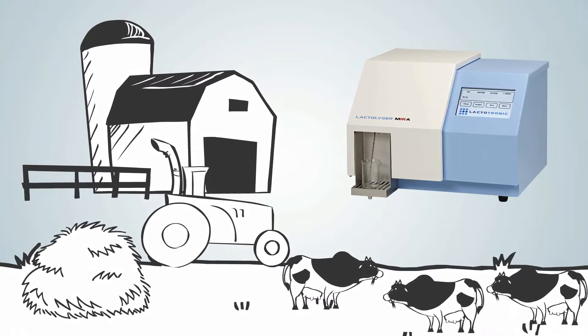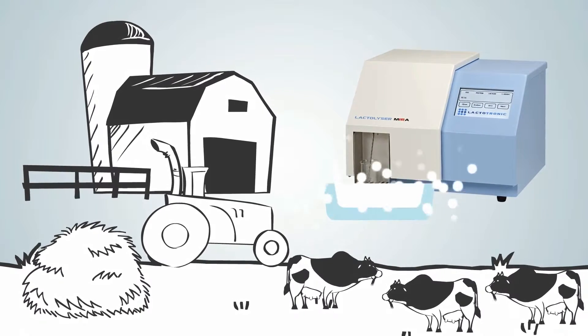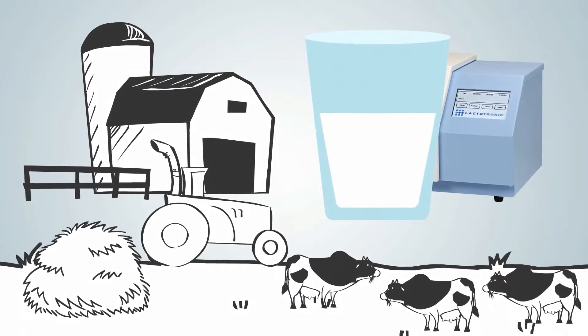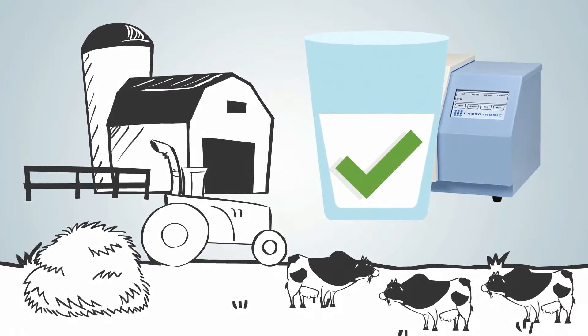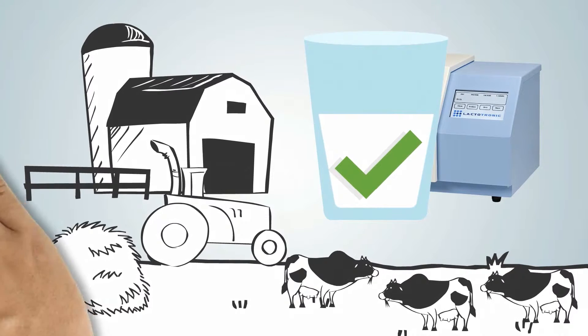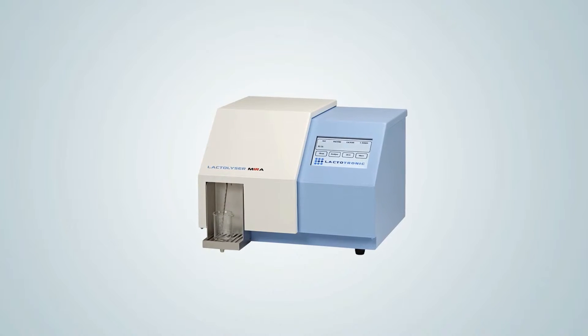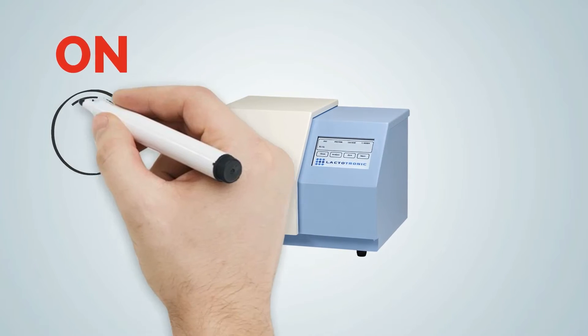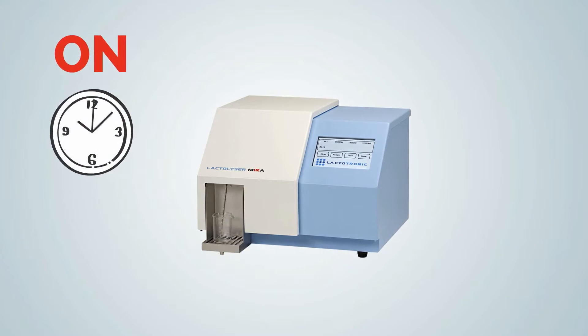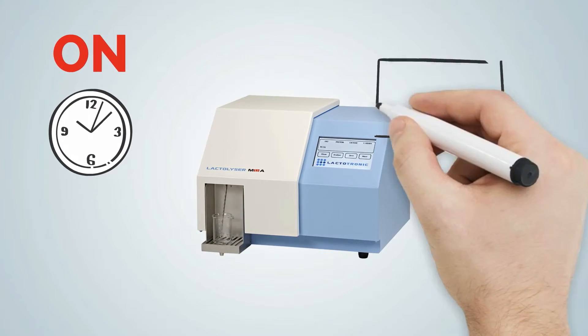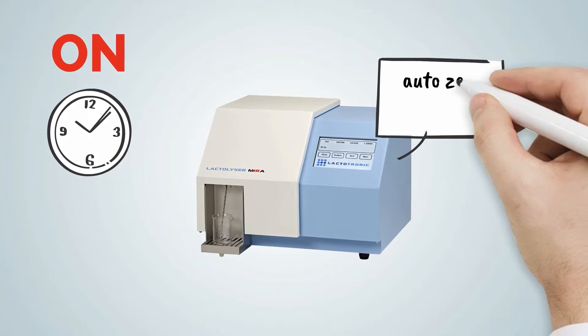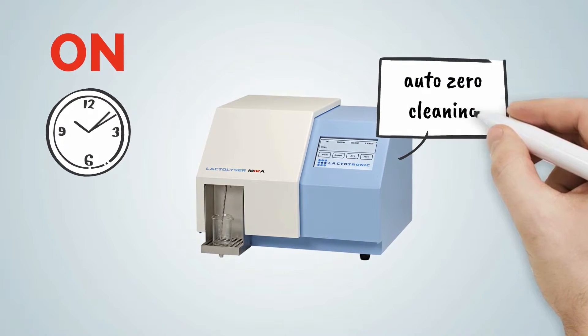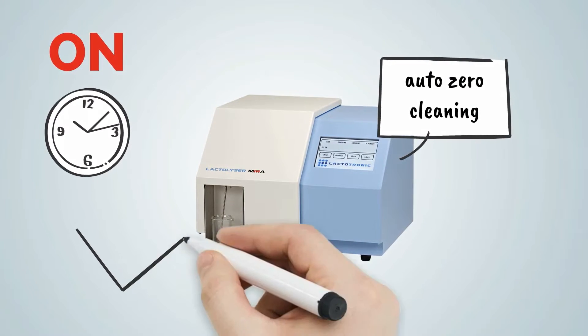Operating the device is easy. Simply switch it on two hours before using it and let it stabilize. Then hit the auto zero cleaning switch and select your product of choice.